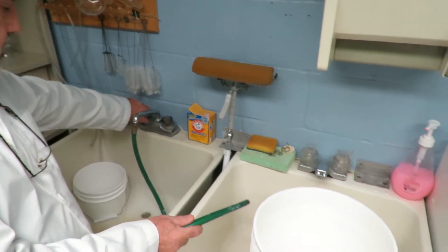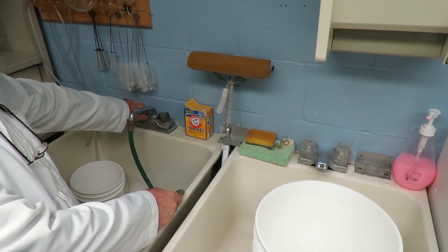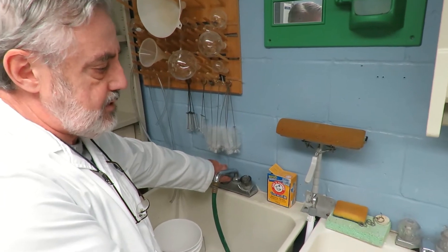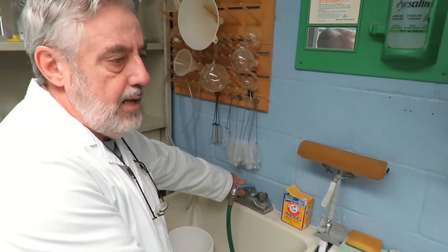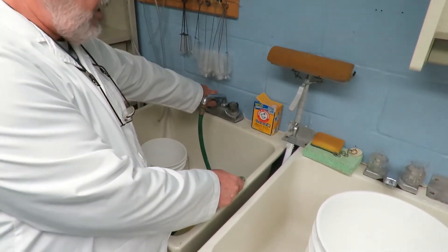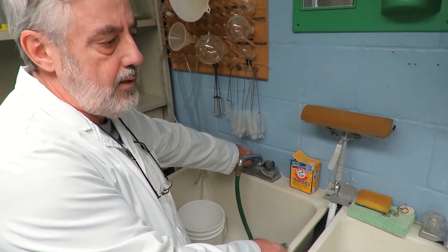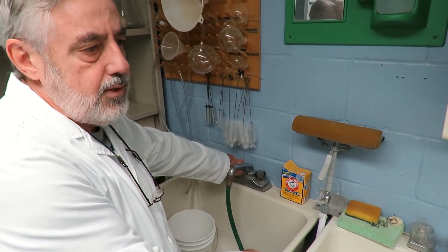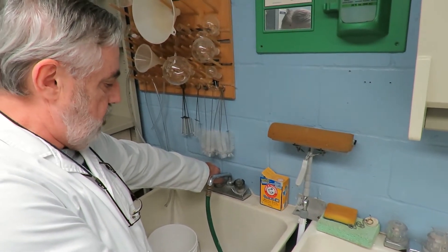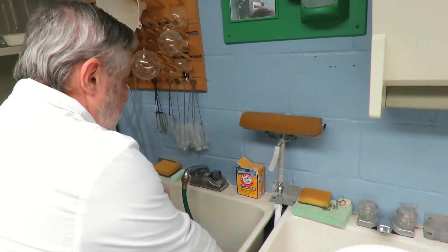The first thing recommended is to run your water for a good 20 minutes before you fill your bucket. The reason is to empty your pipes of any standing water, so you'll be getting water straight from the bottom of the well, which is probably where the highest concentrations of radon are in your water system.